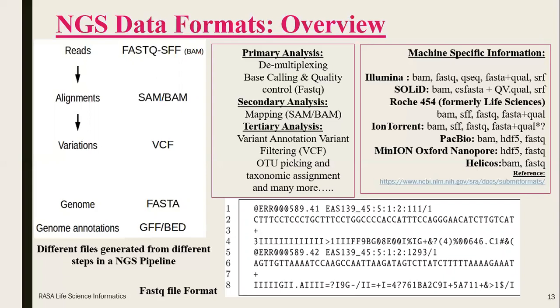The first line is the sequence identifier. The second line is the sequence, followed by a separator, the plus sign in the third line. And then we have some ASCII codes in the fourth line, which internally depict the Phred scores or quality scores. When we start working on our pipelines, you will understand more clearly how file handling works in NGS.